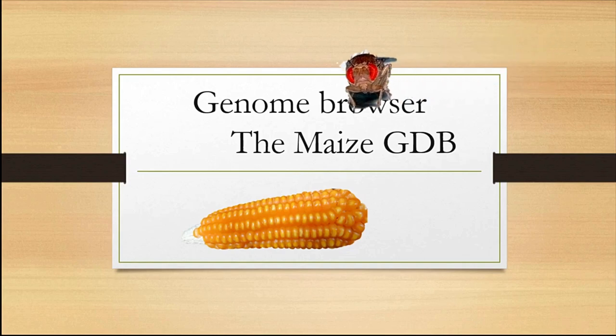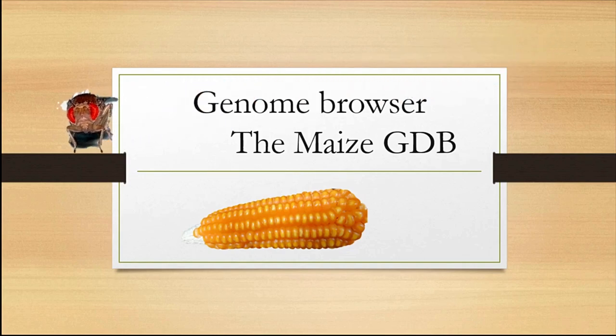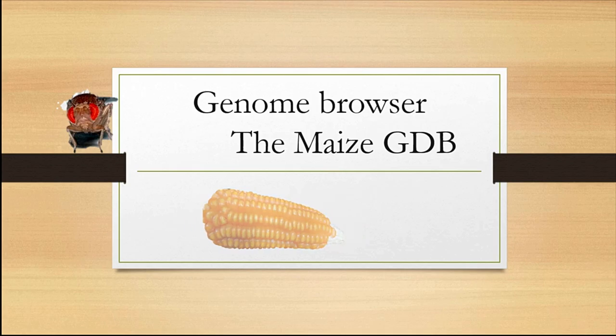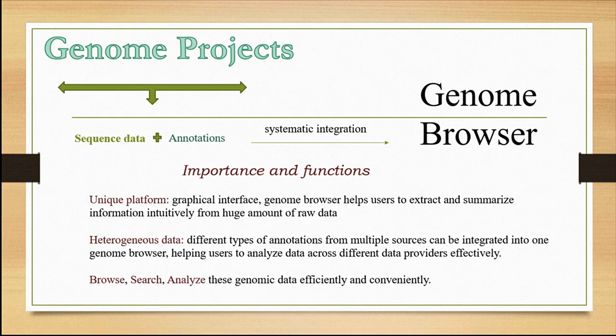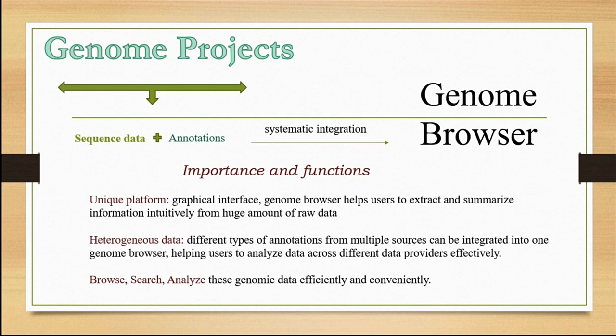Hi friends, in this video we'll be seeing about the genome browser MaizeGDB. Much of the information regarding sequence data and annotations are obtained from genome projects. This sequence data, which consists of millions of base pairs and its meaning—that is annotation—is systematically integrated into web browsers known as genome browsers.